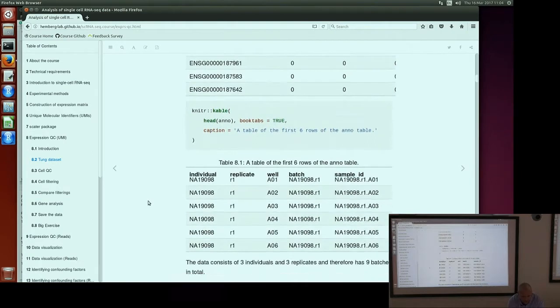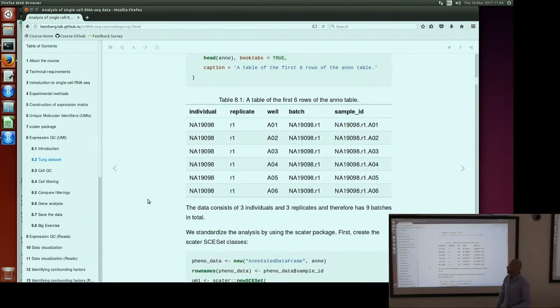If you look at the annotation table, which is the next one, this is basically the metadata that you have with your data set. And here you have association of your cell ID. So you have the same unique cell IDs in this column here, and then it contains a lot of information about each cell. So basically, this table serves you as annotation metadata for your data set.